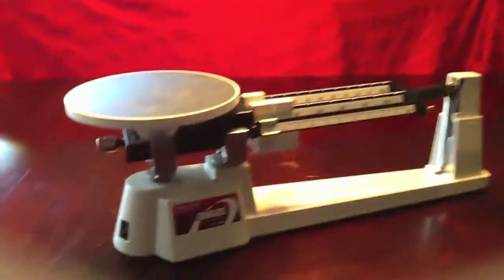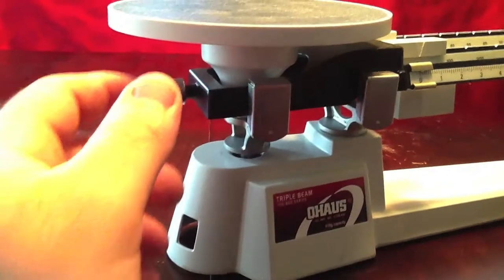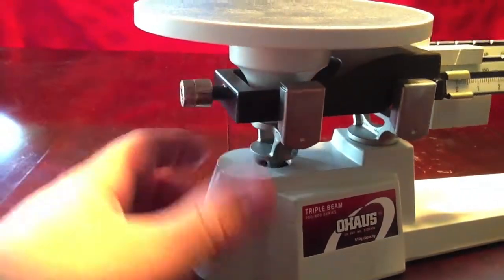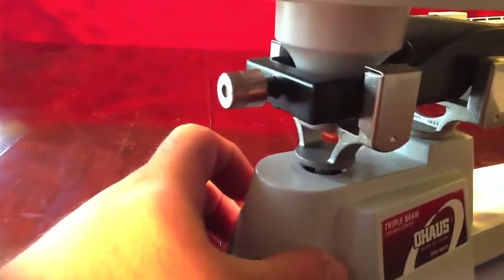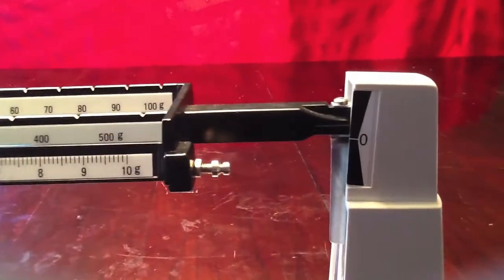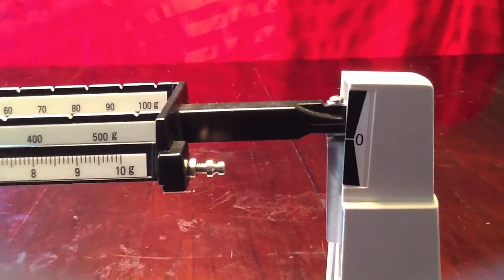To zero our balance, we are going to turn this adjustment knob until our arrow lines up with zero.